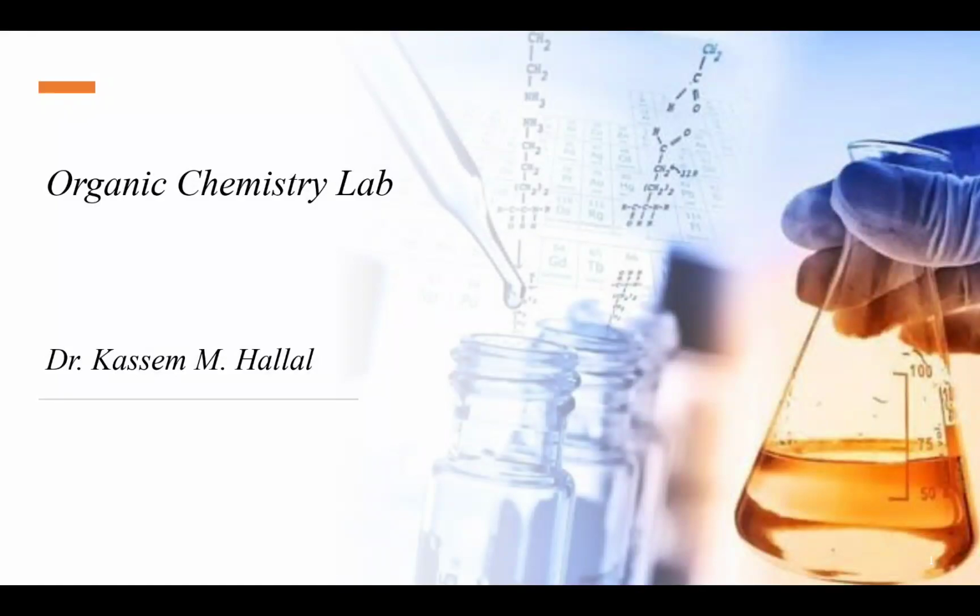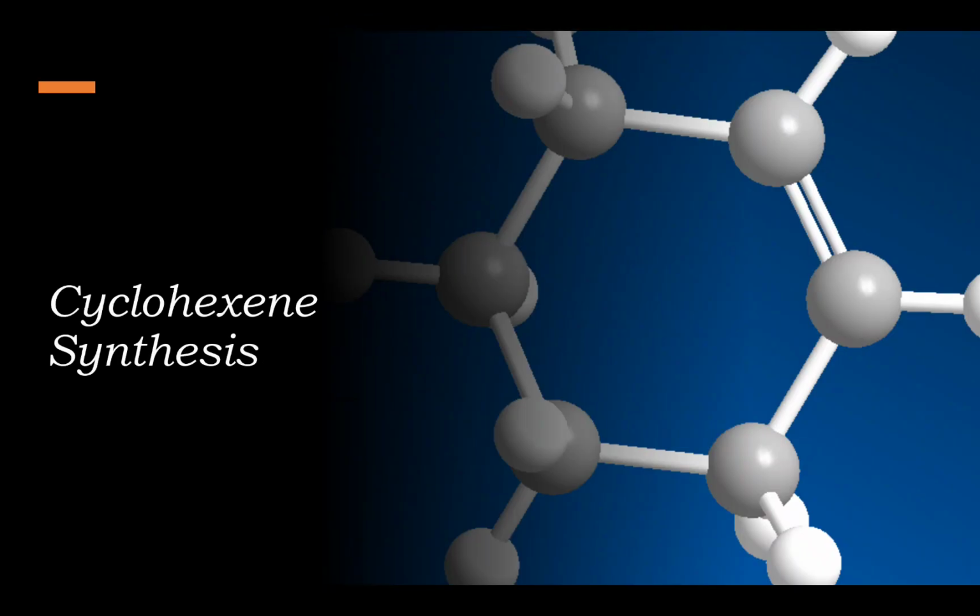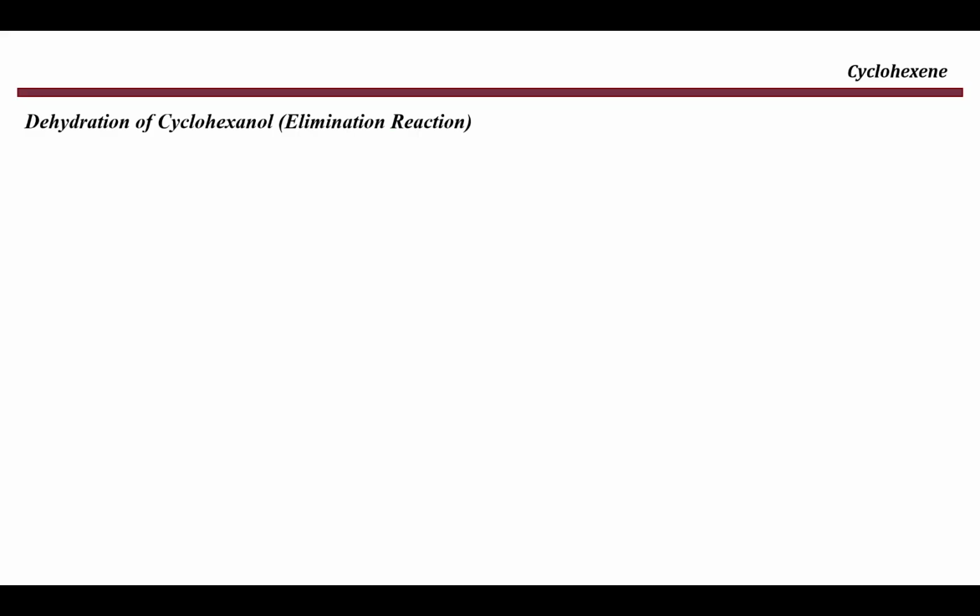Hi, welcome to another lecture in the Organic Chemistry Lab series. In this video, we will talk about the synthesis of cyclohexene starting from cyclohexanol.